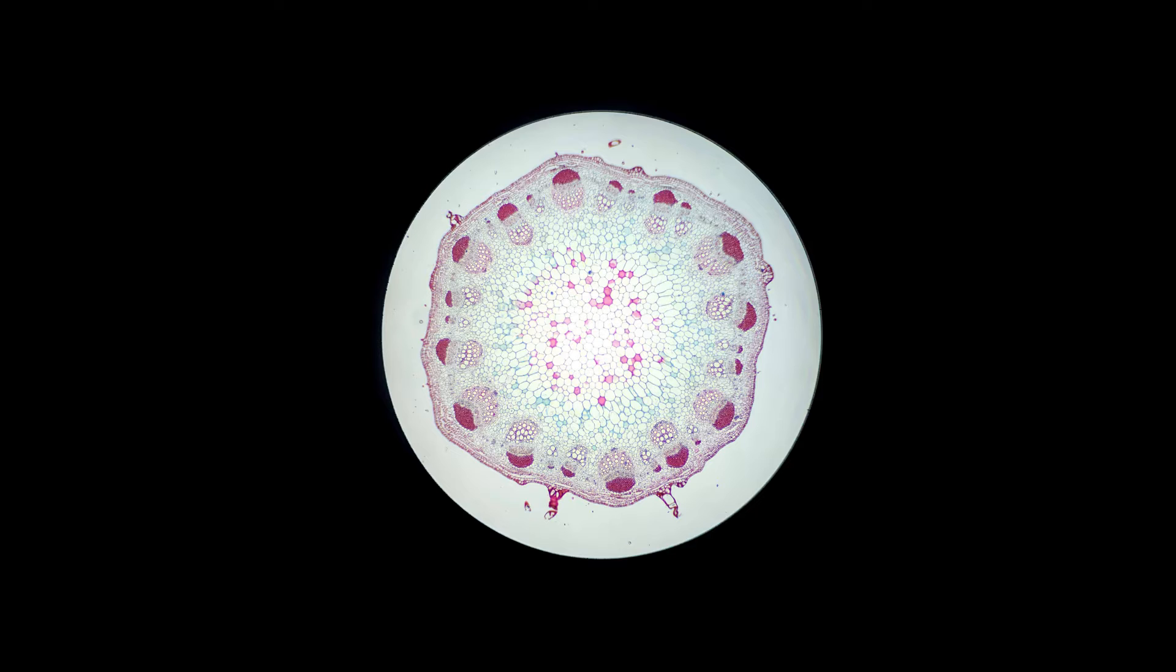Seen here is a cross section of a dicot stem, and you can really see the xylem and phloem very well. Again, those are the vascular structures that will be transporting water and nutrients. This ring goes all the way around the outside of our stem here in little bundles that form a nice ring.